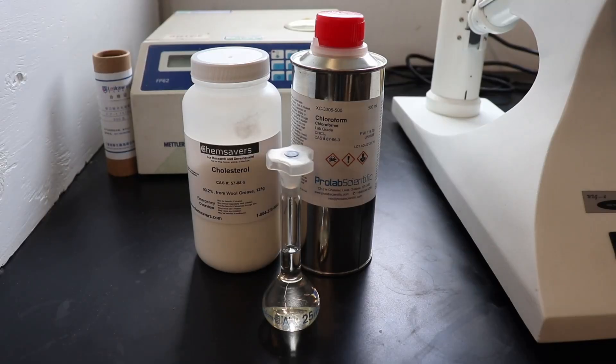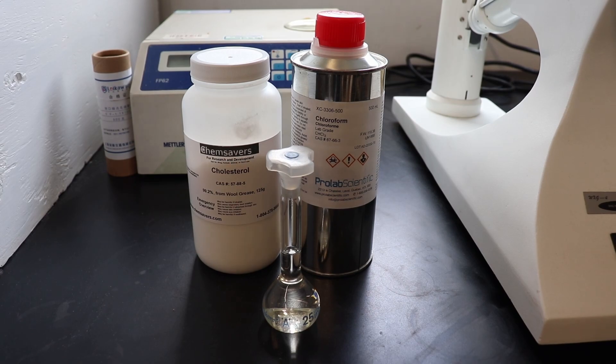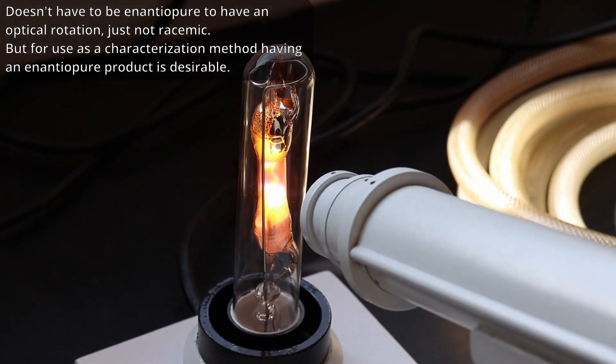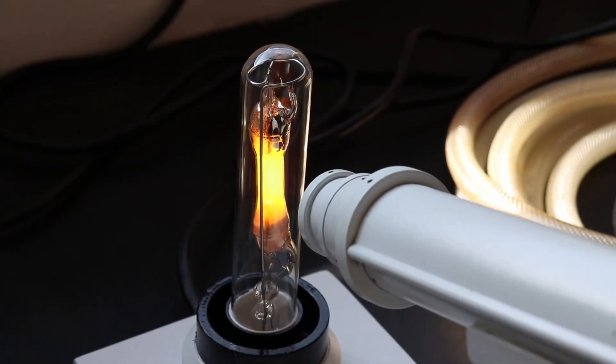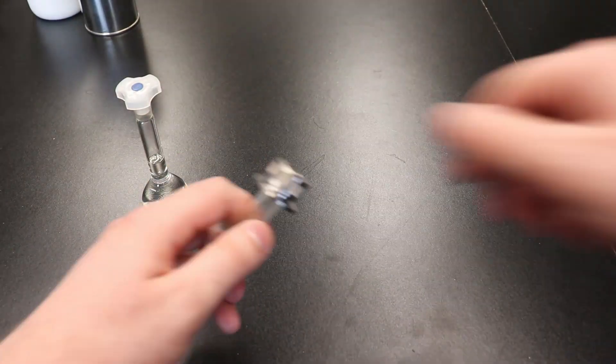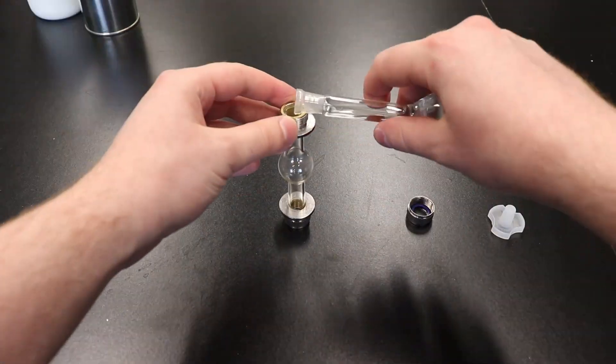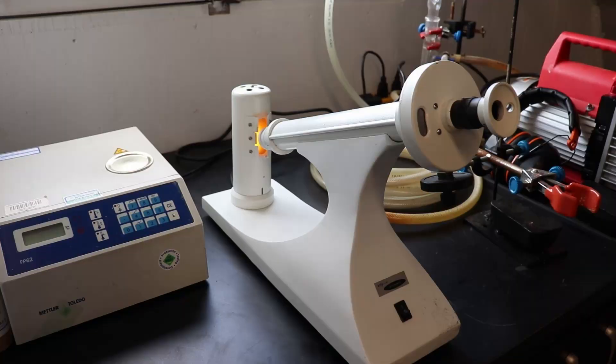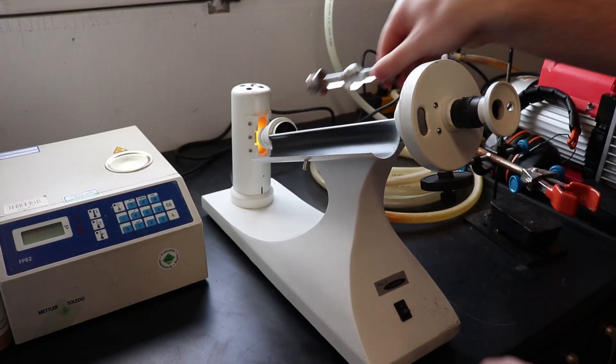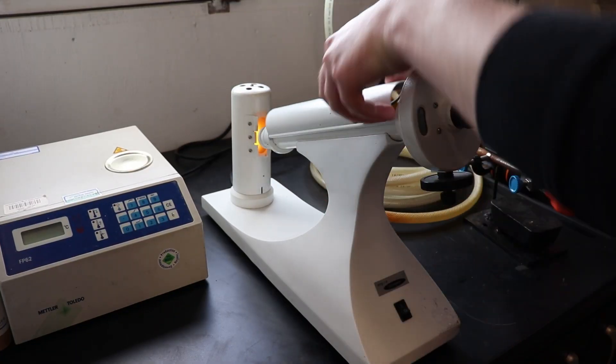Since both cholesterol and cholesterol acetate contain chiral centers and are enantiopure, they possess the property of optical rotation, and thus we can use polarimetry as an additional characterization technique. First I prepared a reference solution of cholesterol dissolved in chloroform at a concentration of 8 grams per 100 milliliters. The solution was transferred into the polarimeter cell and then loaded into the polarimeter.